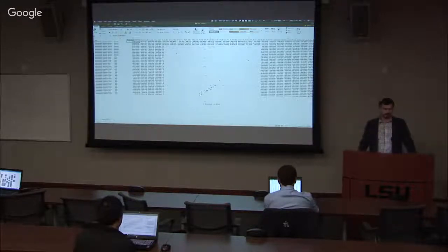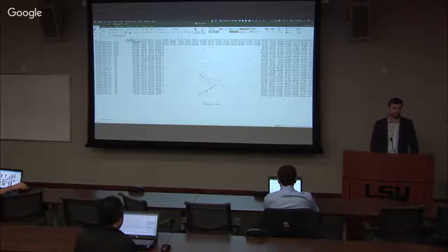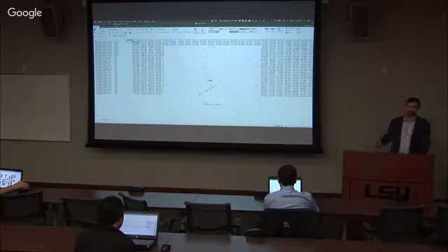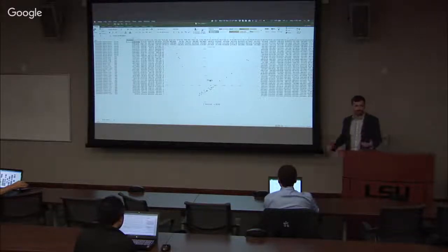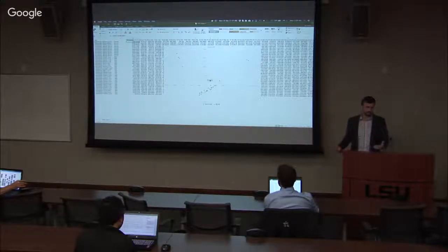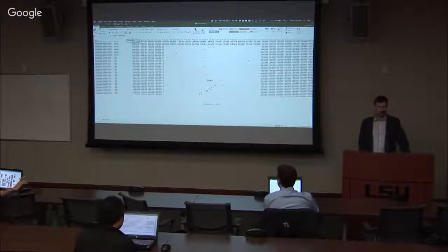Right. So now if I did, let me take this group and do differential gene expression, you can find the genes that are responsible for this separation. But it just kind of gives you an insight visually. What can all of this gene expression tell me about this group of samples that I'm studying? Or exclude maybe some samples, like these in this far quadrant. Exactly. Good.